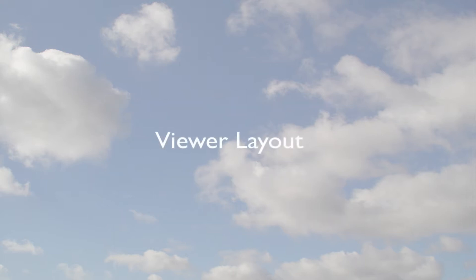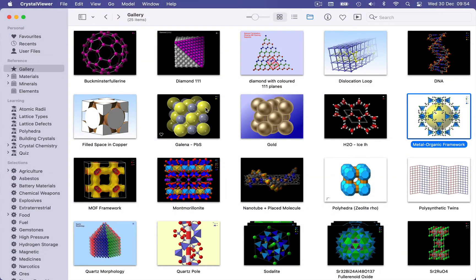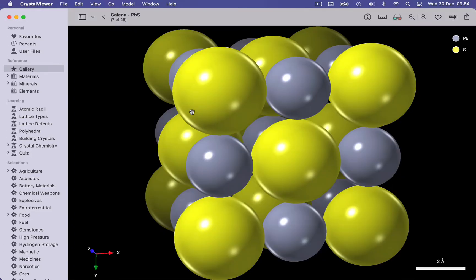Let's start by looking at one of the structures in the gallery. We can double-click any of these thumbnails to show an interactive viewer. Mac users can also use an expand gesture on their trackpads to zoom in on whatever structure is under the thumbnail. So here we have our zoomed-in crystal structure, and we're showing part of the lead sulfide structure. This is the mineral galena.